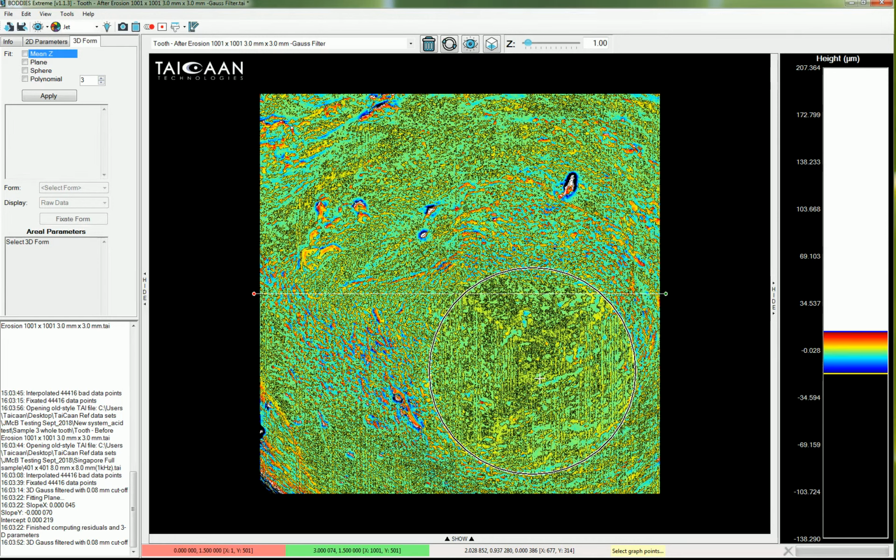And in fact, you can see the peak here. You can see this would be the peak of the pyramid structure with the three sides going up to the left, to the right, to the left, and down to the left here. So let's put that in the center. You can see actually it's a bit off center, so I'm having to bring it down here, which is now corresponding to the outer regions, which you can see quite clearly from this image.